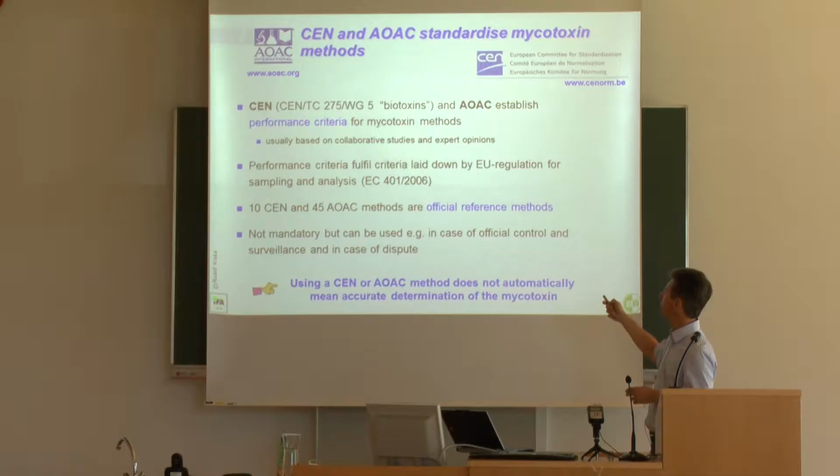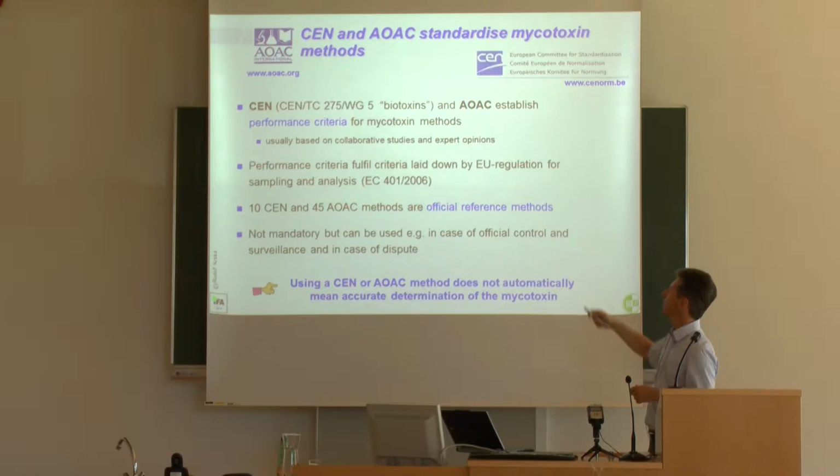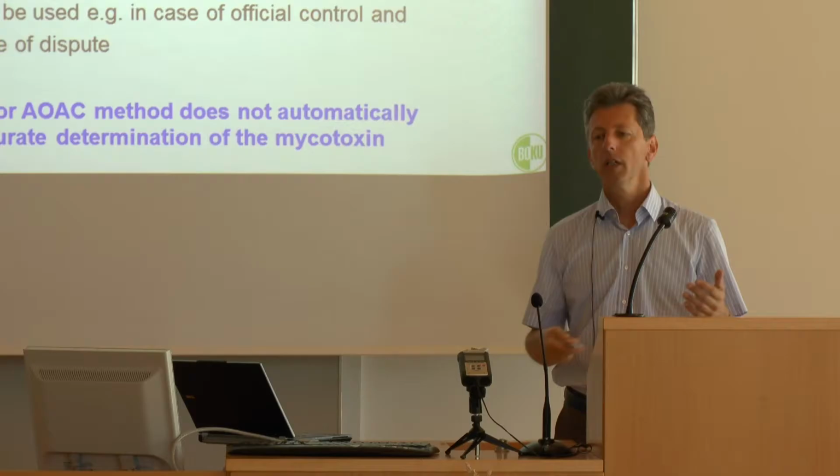And the American counterpart, so to speak, the Association of Official Analytical Chemists, they establish performance criteria for mycotoxin methods. CEN in Europe, AOAC in the US. And these performance criteria, for instance, what is the recovery, what is the LOD which is required, the LOQ, the limit of quantification for a certain mycotoxin, that is all laid down by these official bodies.